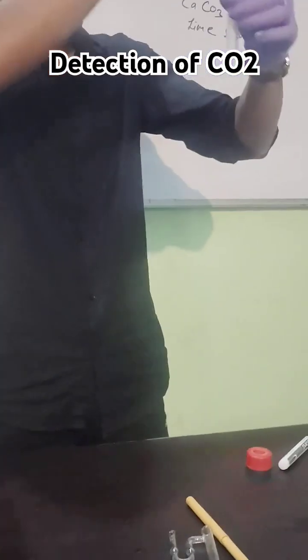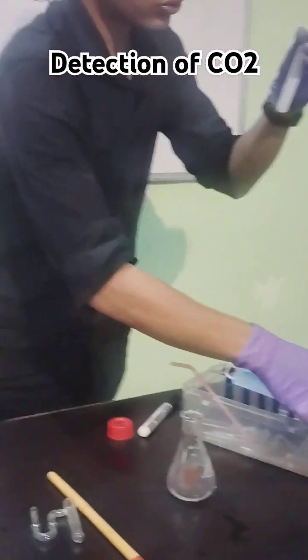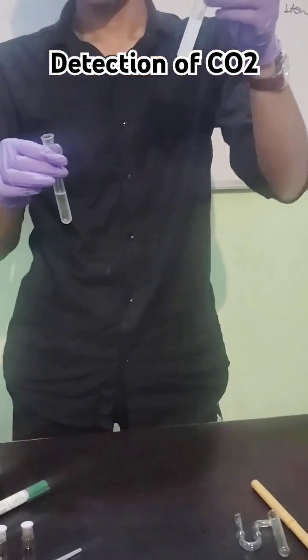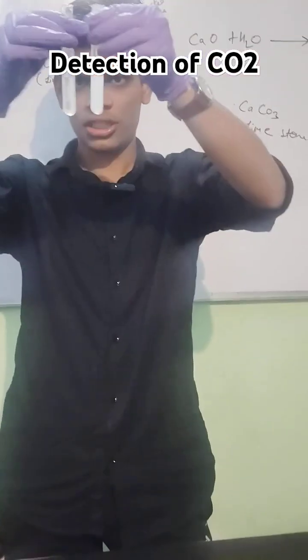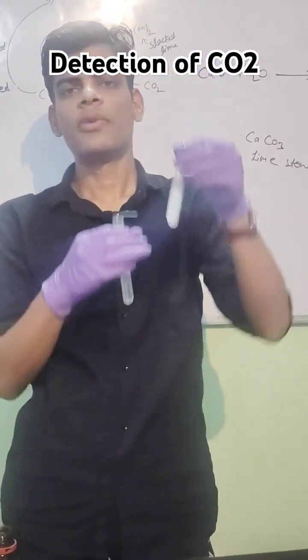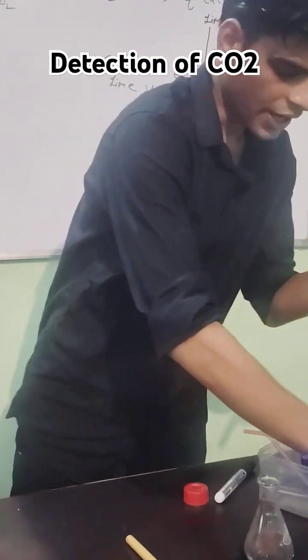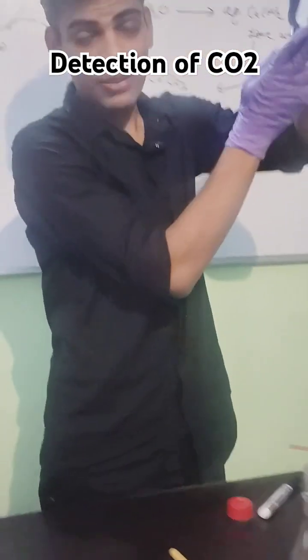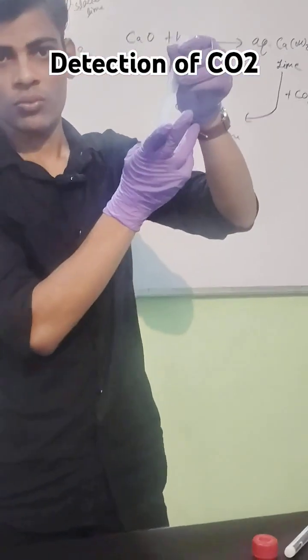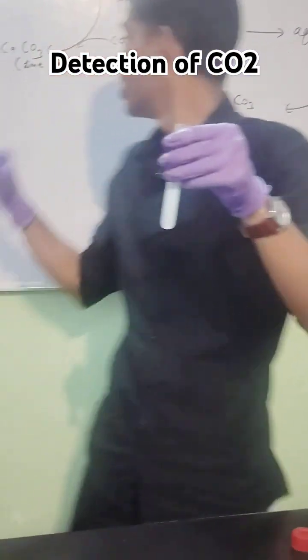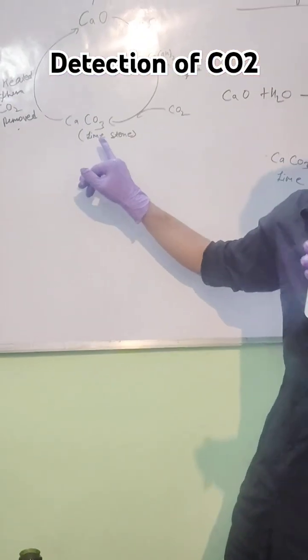Then you can clearly observe that it turns into milky color, or you can say cloudy color. You can see the observation. This confirms the presence of CO2. After some time you can observe that it forms the white precipitate in the test tube, which is known as calcium carbonate or also called limestone.